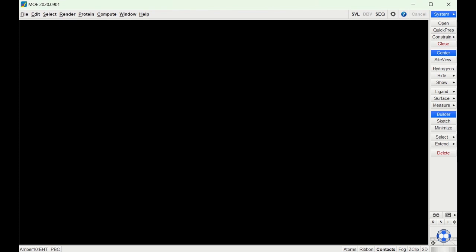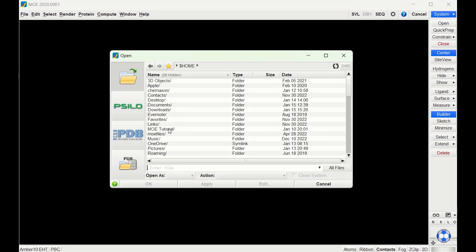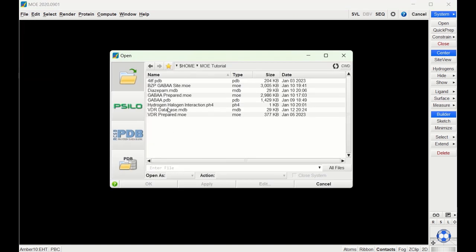In this video we're going to be docking some vitamin D ligands into the vitamin D receptor. Let's start by opening the database where we have some vitamin D receptor ligands drawn out.